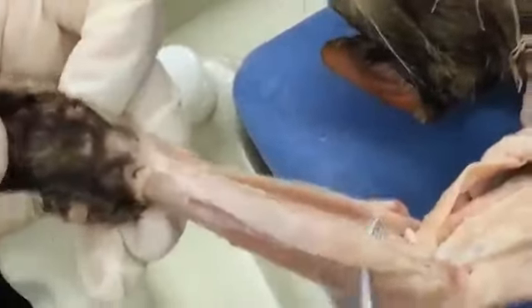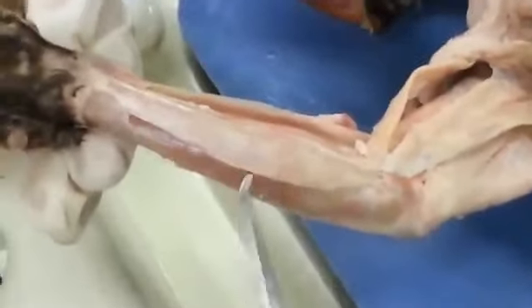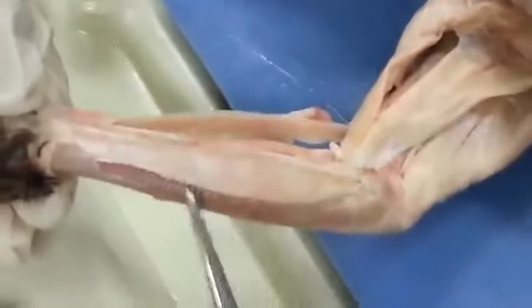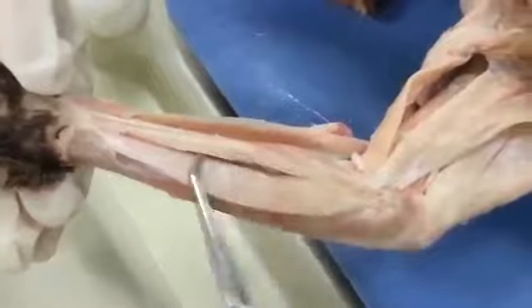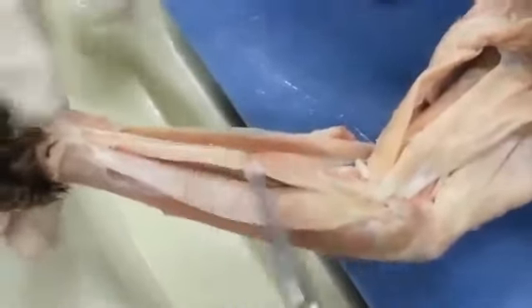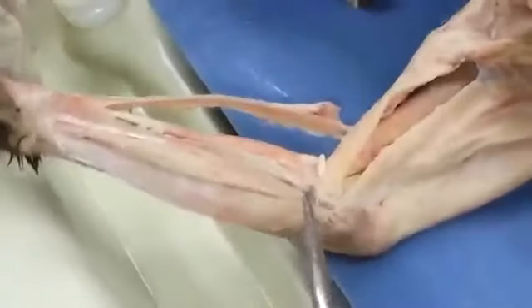As we go to the ventral forearm, the first muscle we're going to see is the landmark muscle, the palmaris longus, which in humans is not that large, right? It's actually a lot smaller in humans, but for cats this would be our landmark. So palmaris longus. If we move in this direction, we're going to see the flexor carpi radialis, and then the pronator teres.